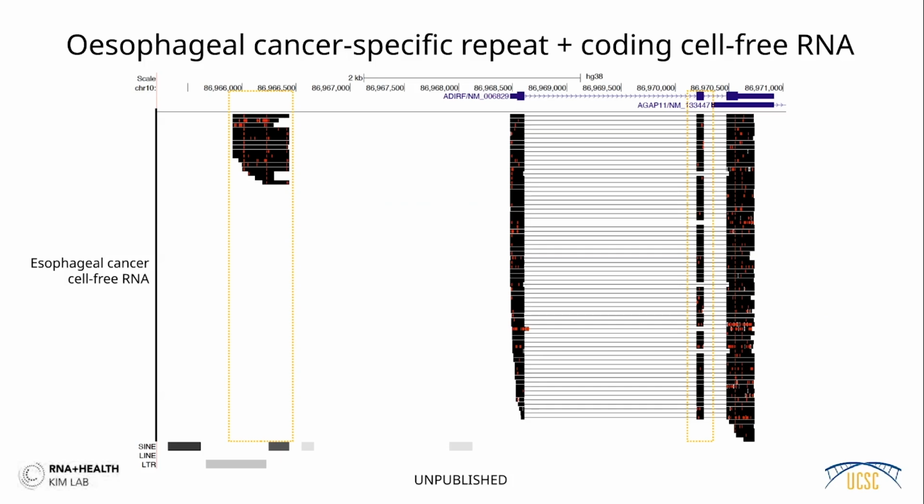And so just one last example here. This is an example, again, of a protein coding RNA where, in black, you see all of these cell-free RNAs that are in the circulation. And then a little bit upstream of that, we're seeing this novel RNA, again, part of these 269,000 novel unannotated transcripts in the human genome.